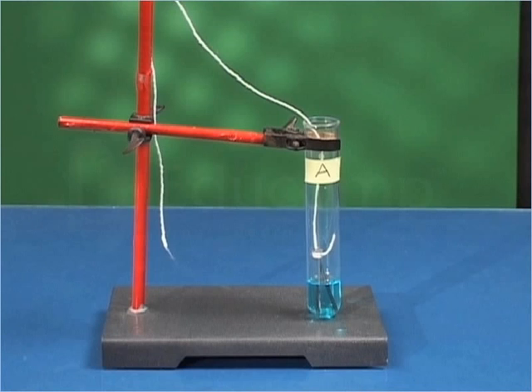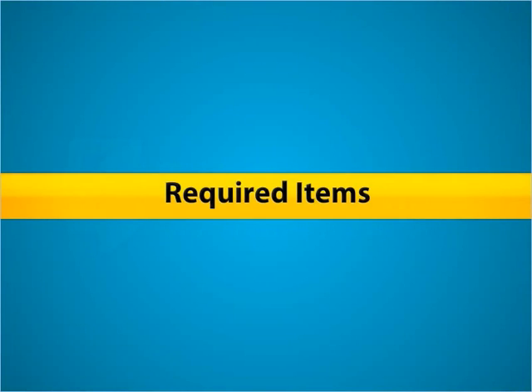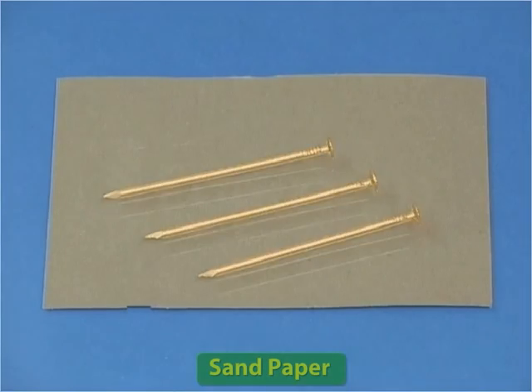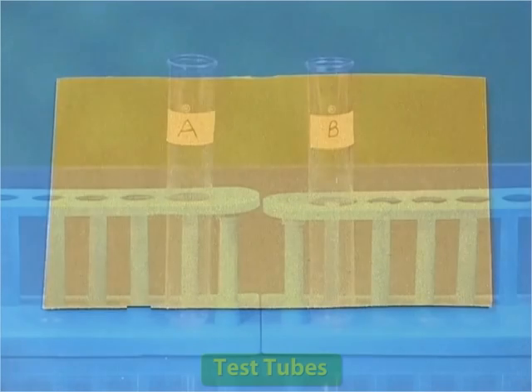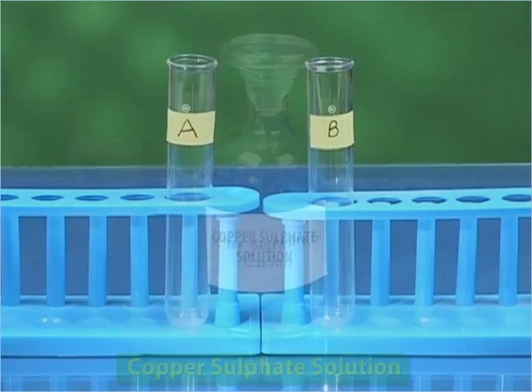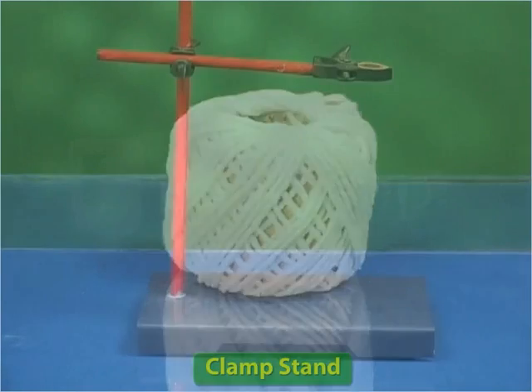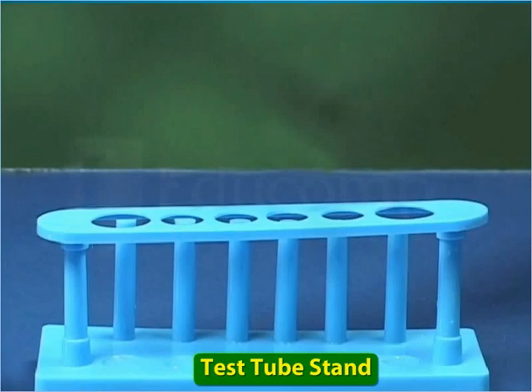Let us perform an activity to find out the details of this color change. For this activity, you will require iron nails, sandpaper, test tubes, copper sulfate solution, thread, clamp stand, and test tube stand.